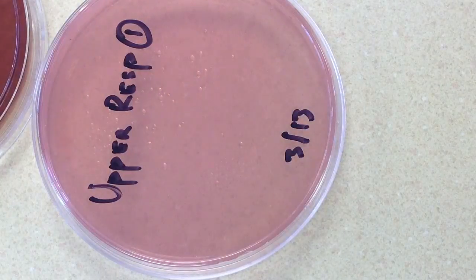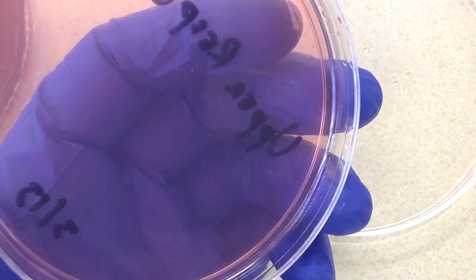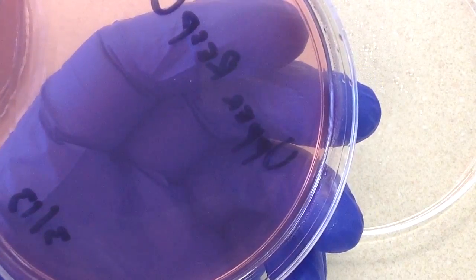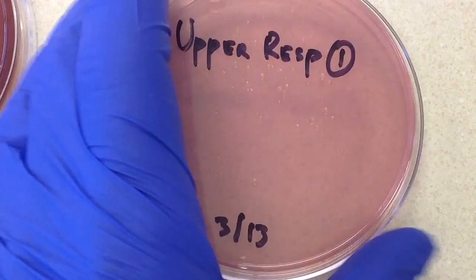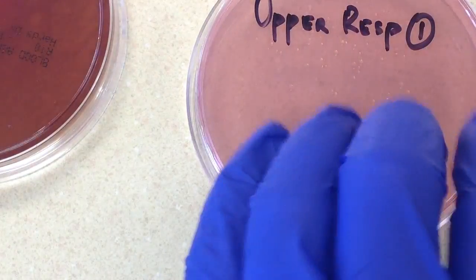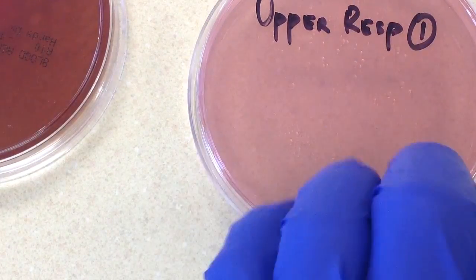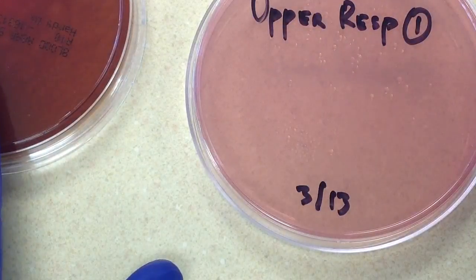Let's look at our last plate, our MacConkey's plate. It has no growth on it. So even though I didn't list any members of Enterobacteriaceae or Pseudomonas as pathogens from this culture type, there's no growth on it, so we can rule out all of those types of organisms.